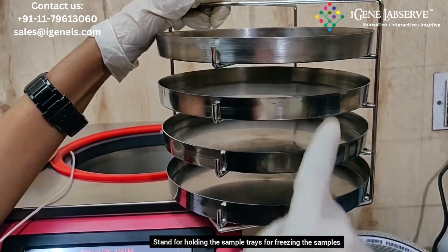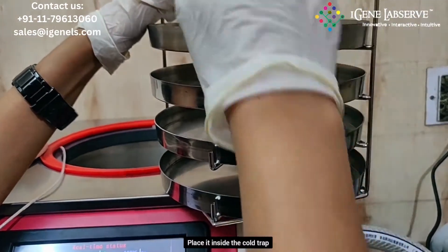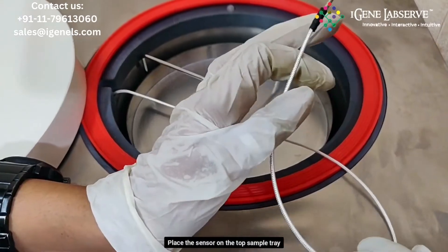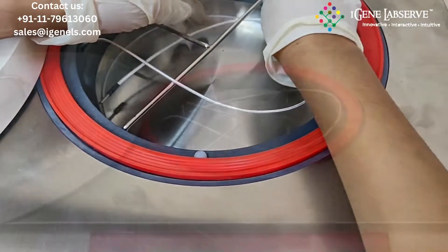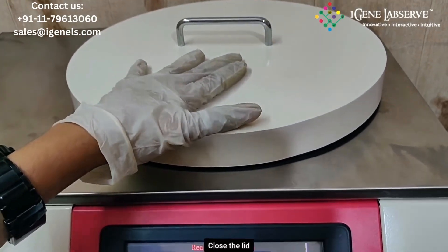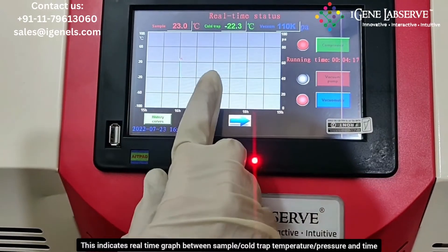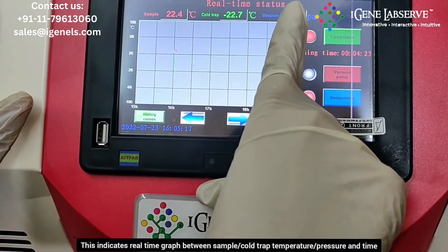This is the stand for holding the trays for freezing of the samples. You have to take this, place your samples inside these trays, and place this inside the cold trap like this. Place the temperature sensor on the top tray to measure the sample temperature. Now place this lid on top for freezing the samples.